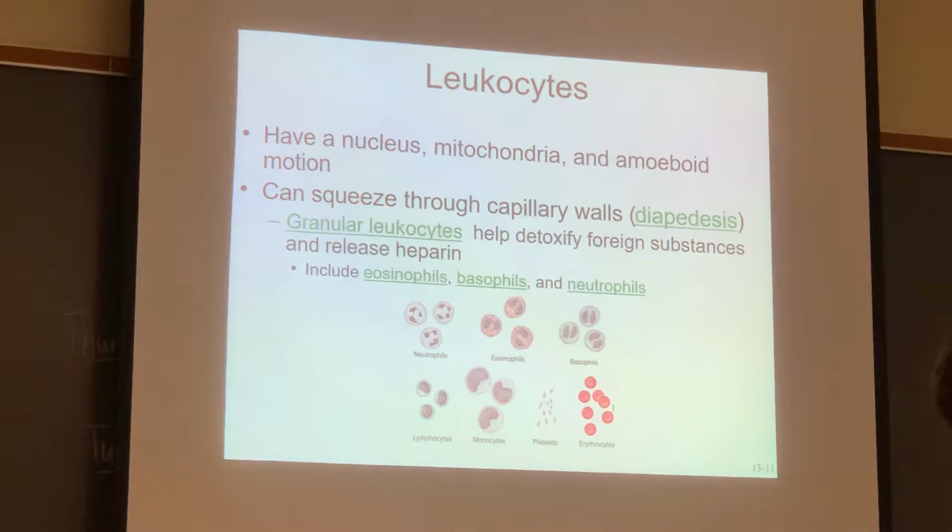Back in the day, before I was told I'm not allowed to use real blood, I had the students actually do blood smears when we did Wright stain. So we had them prick their fingers and they would smear, and then we'd do a Wright stain and actually prepare the blood smear. And I remember one time this girl who was in the class, she had a high number of lymphocytes, and she's like, I don't know if this is right. I said, well, I think it looks right. And the next week she was diagnosed with mono. It was so interesting.